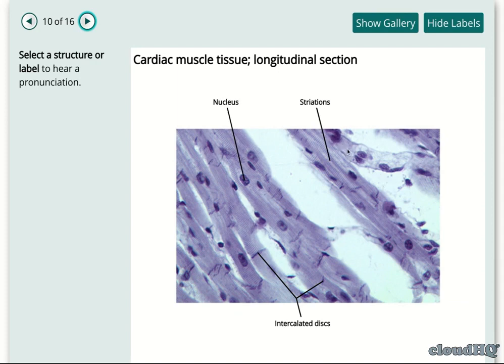Well, we're actually going to look right here. This branching off of the main piece of muscle, right? We have all of these different branches. They keep separating, like a fork in a road, right? They are branching. So that separation, it's not just clear parallel bands. It has these branches along with the striations, okay? So look for the branching of the muscle.